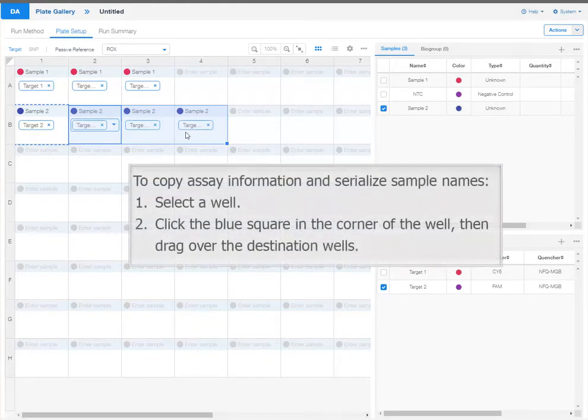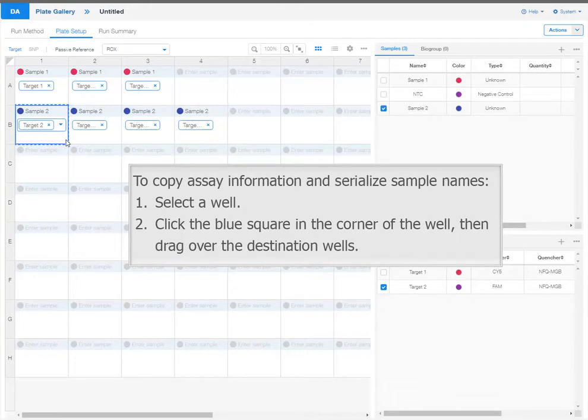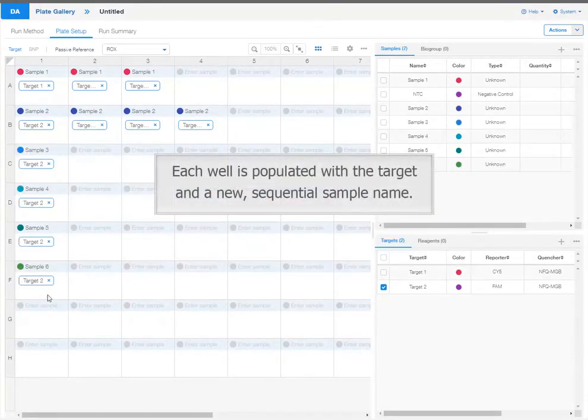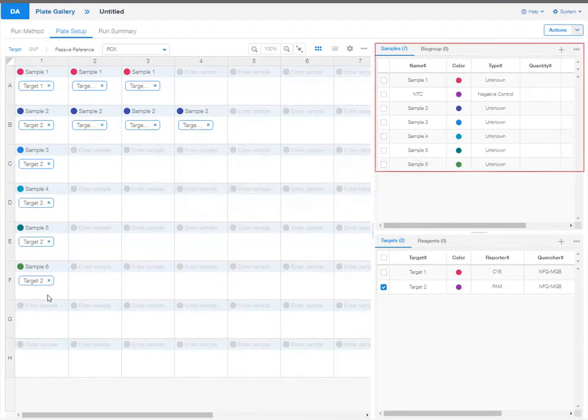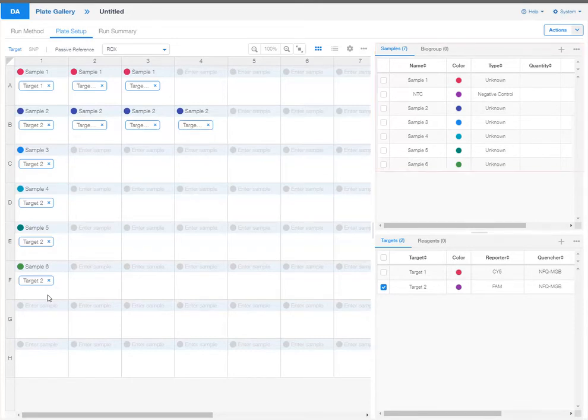To copy assay information and serialize sample names, select a well. Click the blue square in the corner of the well, then drag over the destination wells. Each well is populated with a target and a new sequential sample name. The new samples are also added to the sample table.